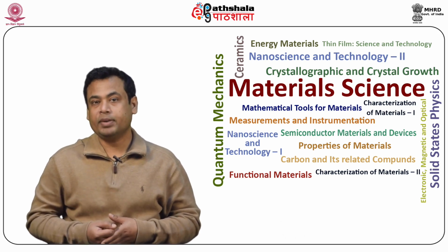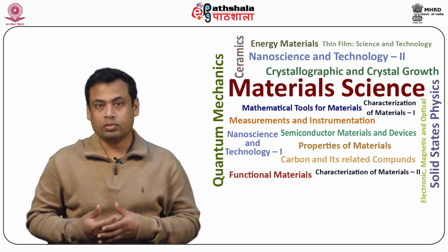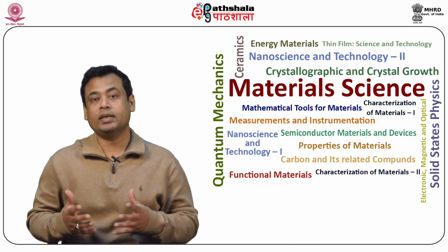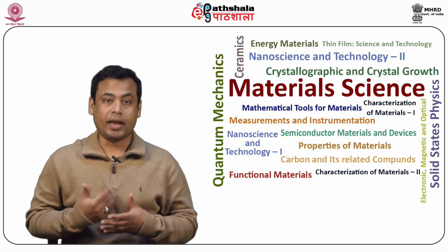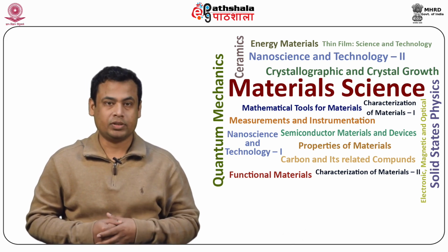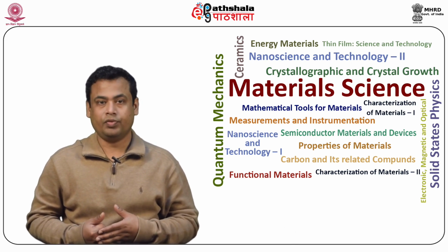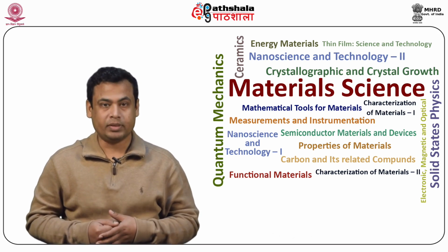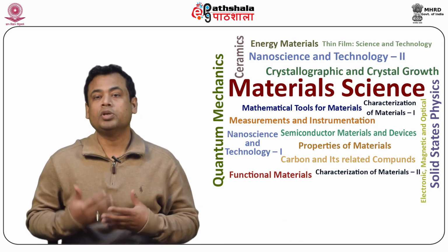Fluorescence spectroscopy has been used widely as a tool for quantitative analysis, characterization, and quality control in the pharmaceutical, environmental, agriculture, nanotechnology, and biomedical fields. In this lecture, we will discuss the properties of the individual components in a spectrofluorometer and how these properties affect the observed spectral data.